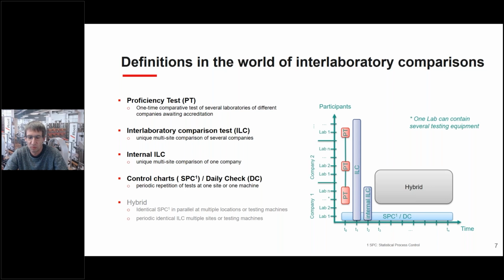A very similar thing is interlaboratory comparison tests over all your labs within your company, and also over company borders with other companies, which you should do with a higher frequency, but it's maybe not as formal as the accredited version, but it can give you some hints if anything is wrong in between this 2-year interval.